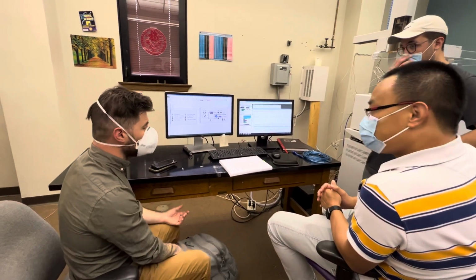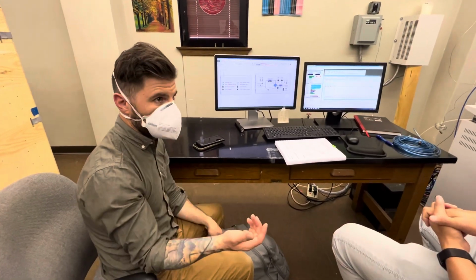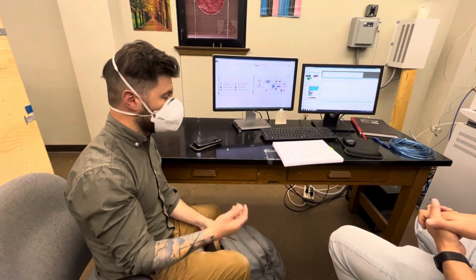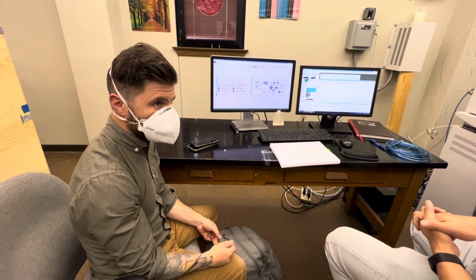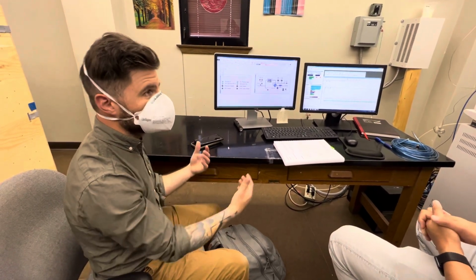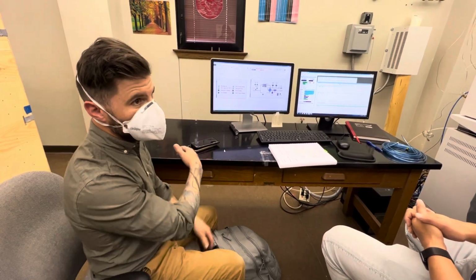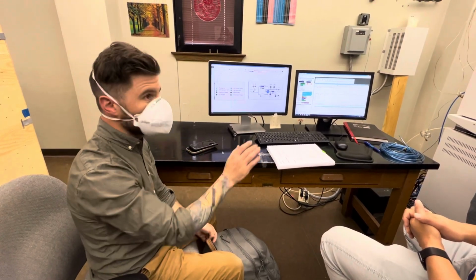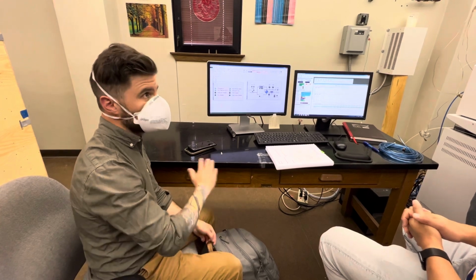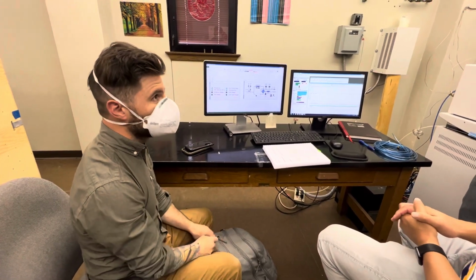And the other utility of this is when you want to run other people's data, other people's samples, and you could say our long-term stability is less than 0.02 per mil. So over the last 3 years, our machine doesn't deviate. So when you send us stuff, you can rest assured we have a really good sample. Oh, super cool.